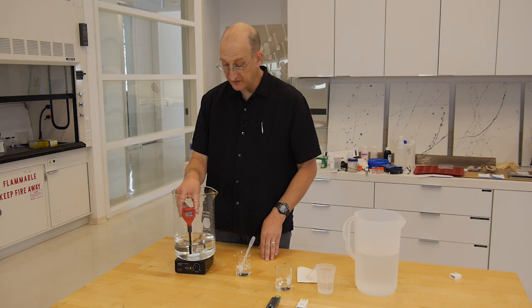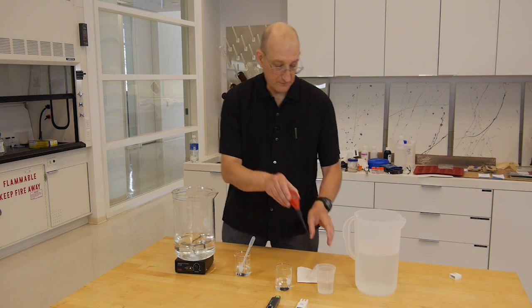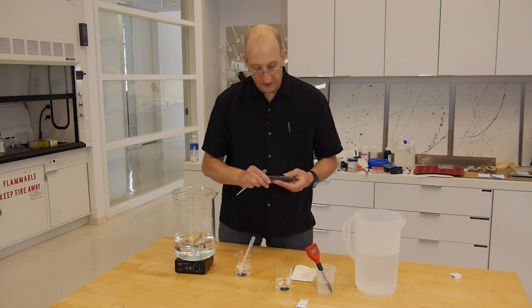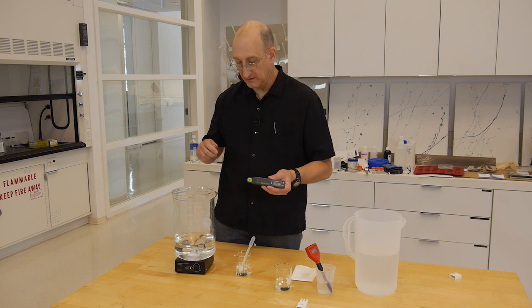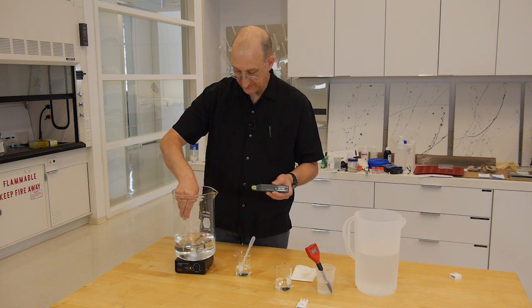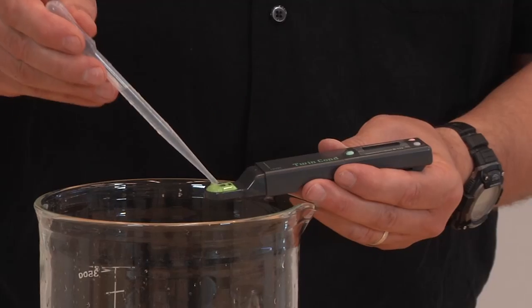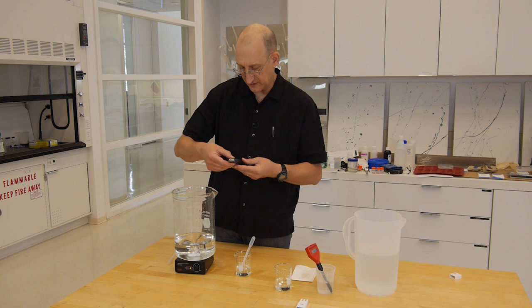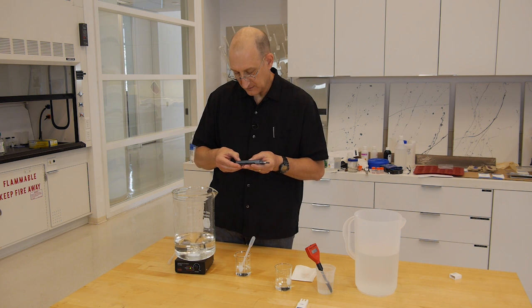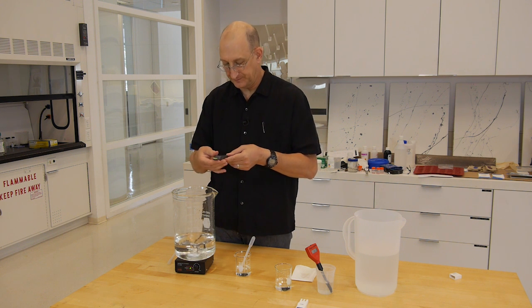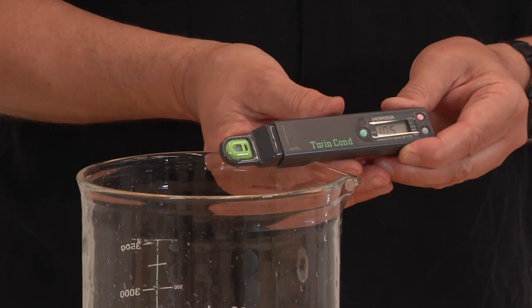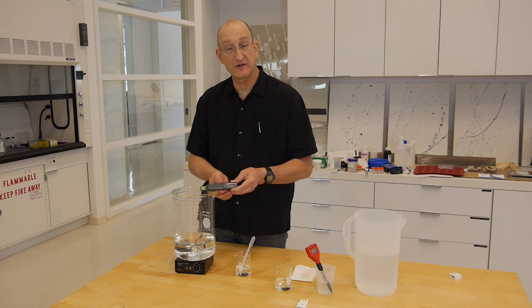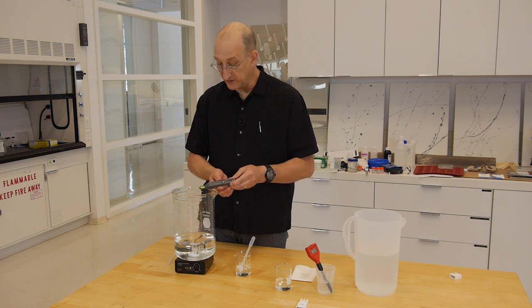So we now have the pH set to 6, we'll want to check the conductivity. So we'll use our calibrated Horiba, this is the more expensive conductivity meter. And we can just put the sample in the little sample well. And we have a reading of 10.5 millisiemens. So that's 10,000 microsiemens. And we want a final conductivity of 6,000 microsiemens. So we have to dilute this down.